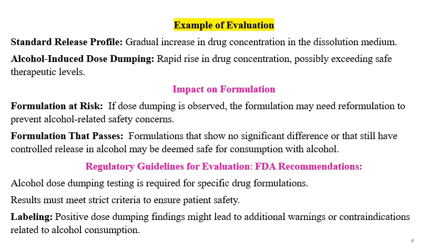Example of evaluation, standard release profile versus alcohol induced dose dumping. For standard release profile, a gradual increase in the drug concentration in the dissolution medium is the standard release profile, while a rapid rise in the drug concentration, possibly exceeding safe therapeutic levels, is the alcohol induced dose dumping. Impact onto the formulation.